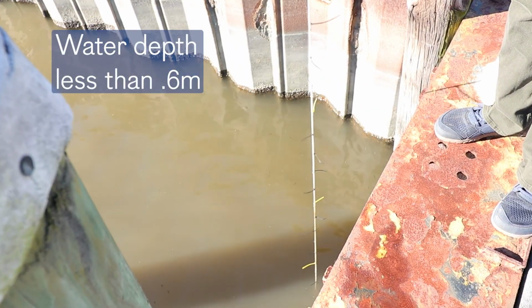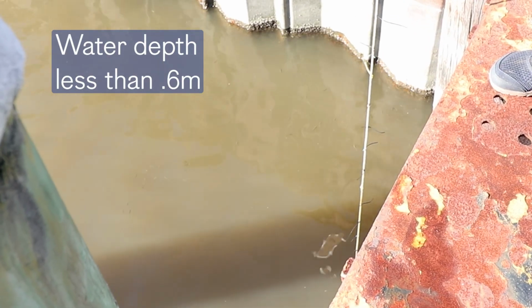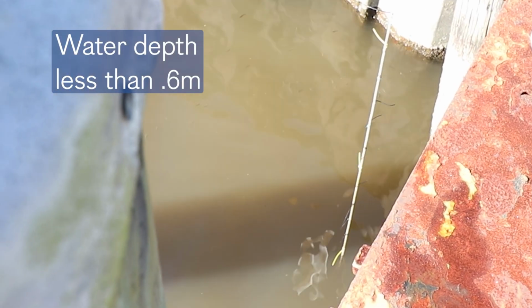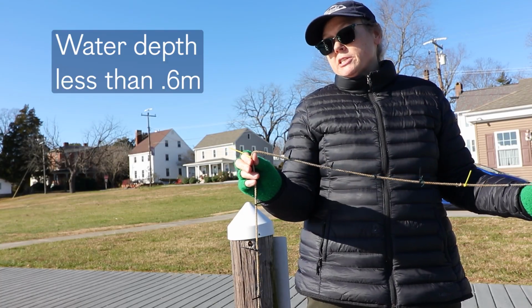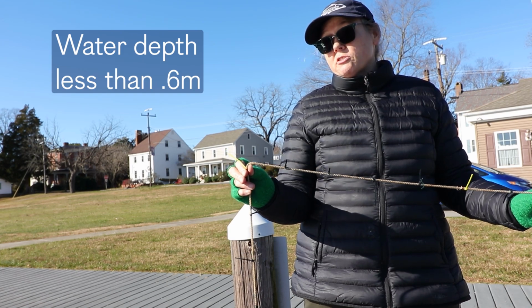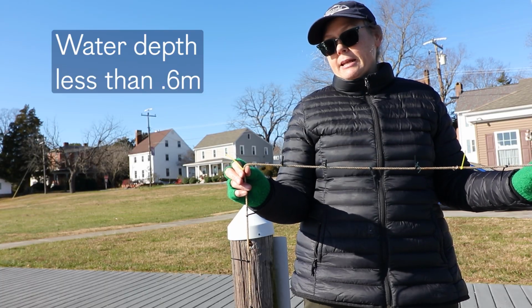So we're at a shallow water site, and the water came up to the first bright zip tie, which is 1/2 meter or 0.5. The black zip ties are at 0.1 meter. So we're going to round it to 1/2 meter. And because this is a shallow water site, this is the only measurement where we are going to divide it in half.